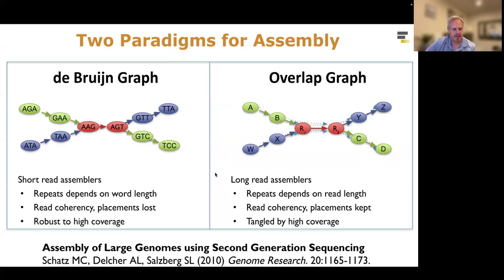Okay, so now that we can collect data: whereas short read sequencing is commonly assembled through a De Bruijn graph assembler, for long read sequencing we're often going to be computing an overlap graph. We're going to take entire 100,000 base pair reads, compare them to other 100,000 base pair reads, and keep track of the overlaps between them. That gives us a lot more information to resolve some of those tricky repeats. The main downside is that computationally it requires more work to look for those overlaps, although modern de novo long read assemblers have really optimized that approach, where a typical mammalian genome can now be assembled in a few thousand core hours, whereas years ago it would take hundreds of thousands or millions of core hours. So there's been orders of magnitude improvement on the assembly side through better software and better algorithms.